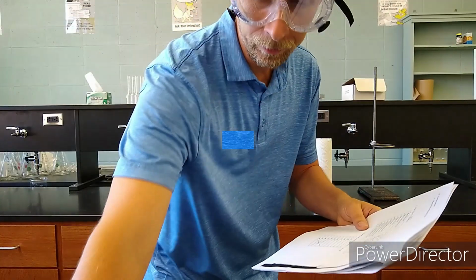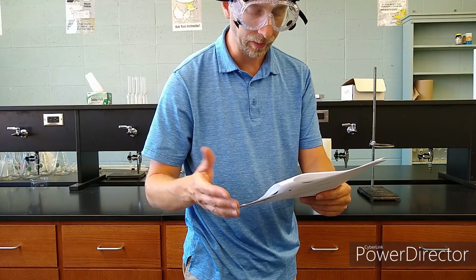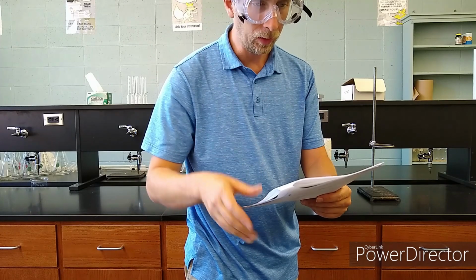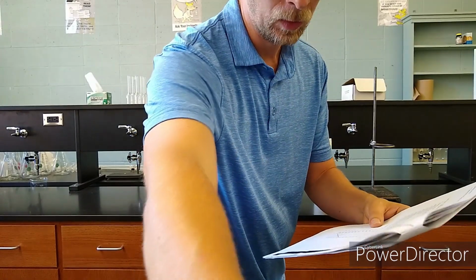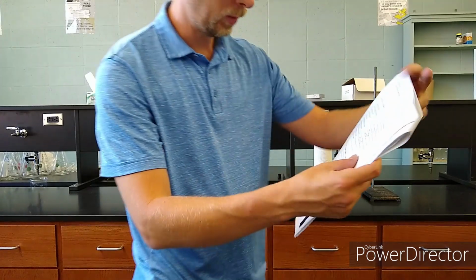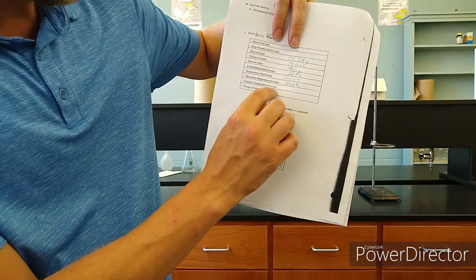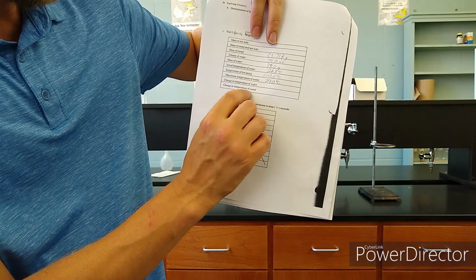Right, now that is the experiment the second time around, and the only thing left is the calculations now. So a couple things that I'll give you, of course, here in case you had any doubts. We need the change in temperature of water, change in temperature of metal.